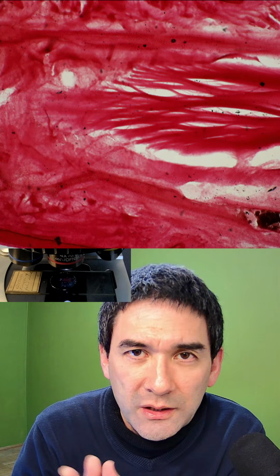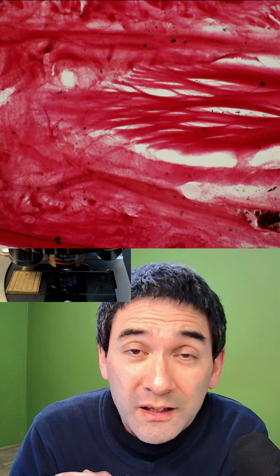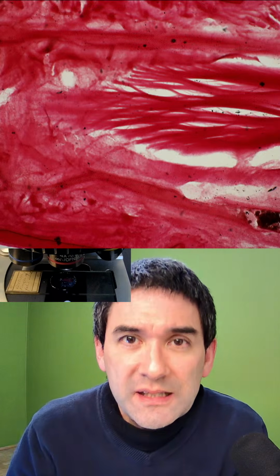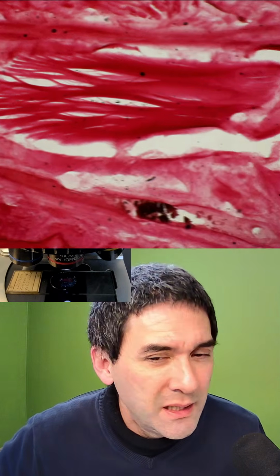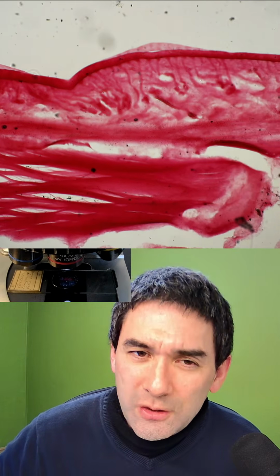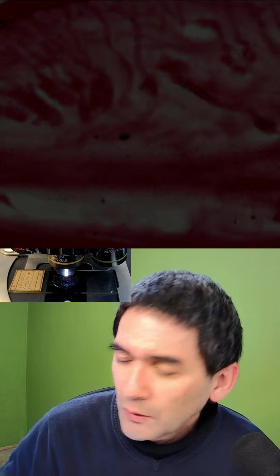So it's a simple histological cut. It was dehydrated, I'm quite sure, embedded in paraffin, and then mounted in Canada balsam. It does not say on the slide, but at that time, Canada balsam, to my knowledge, was extremely popular. So that's basically not quite as interesting maybe. However, you are able to see over here as well.